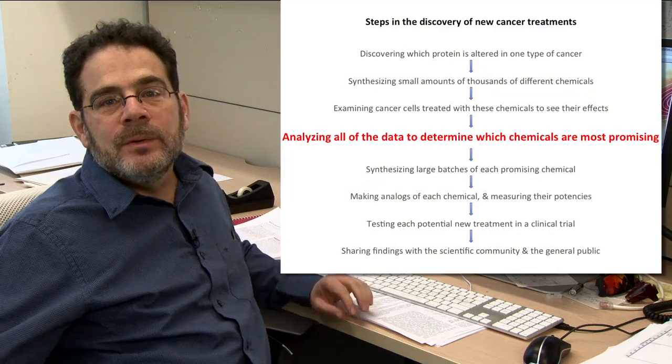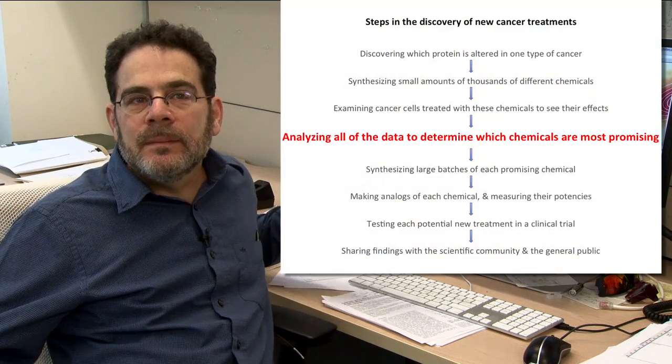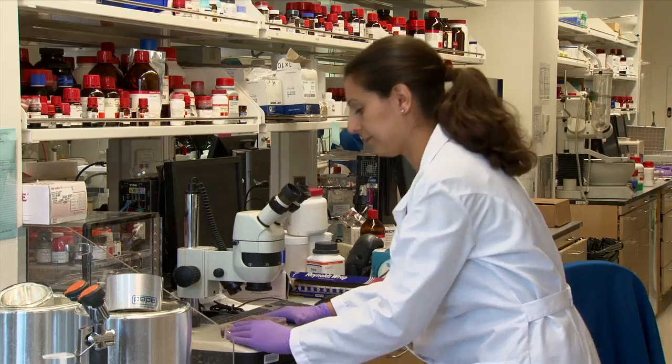Hi, I'm Aaron. I'm a computational biologist here at the Broad. And what I do is I take data that's produced, like the experiments that you just saw with 300,000 chemicals, and then I talk to biologists to understand the questions that they're trying to answer, and then I write computer programs to analyze the data and to create graphs so that they can more easily understand what I found. And so this would be an example of the kind of output that would make sense to a biologist.